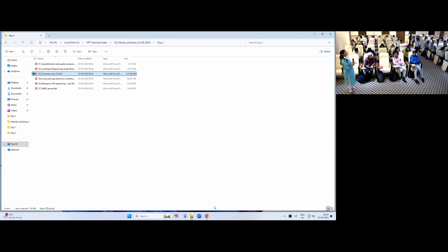Why don't they require it then? Because we have designed them to be Illumina library compatible. So we have designed Illumina compatible libraries.